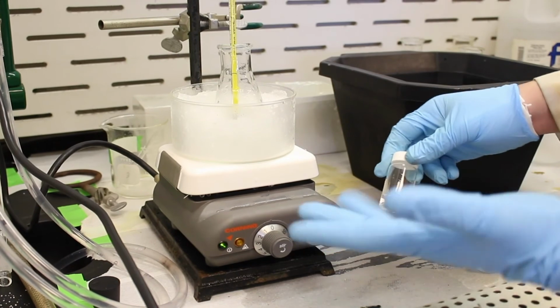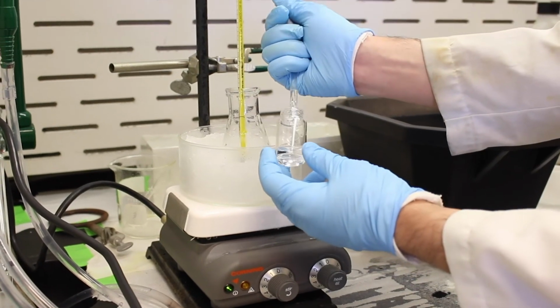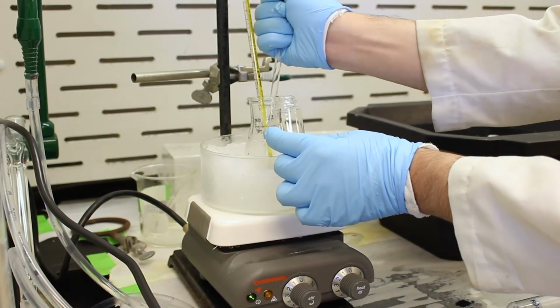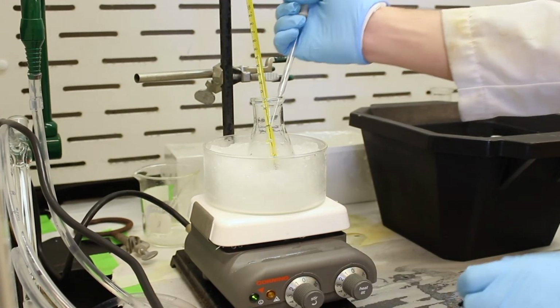Okay, so I changed my glove. We're all good. Now we're going to take our starting material, our methyl benzoate, and we're just going to put it into our reaction flask. Okay, so that's all of it there.